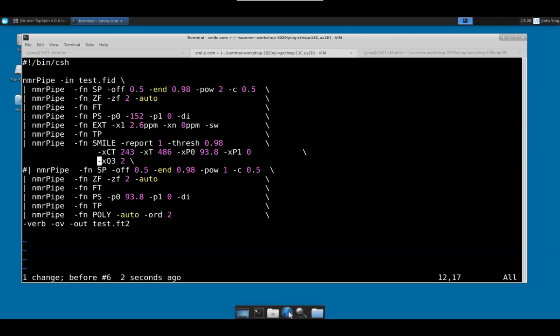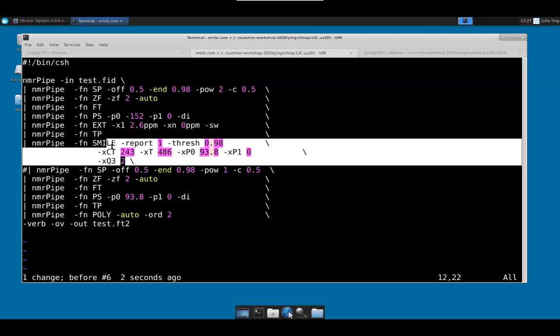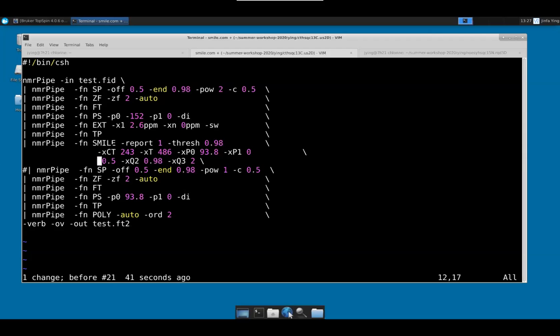Now, by default, we use a cosine instead of cosine square, because usually we do 50% extension. We don't want to use a cosine square, then the extension is too negligible. But when we extend the time domain data by a factor of 2, we often use the power of 2, using cosine square. So you could have just used this, and the script will work equally well, okay? And after that, it's already apodized by the window that I was talking about, therefore you don't need an apodizer again.